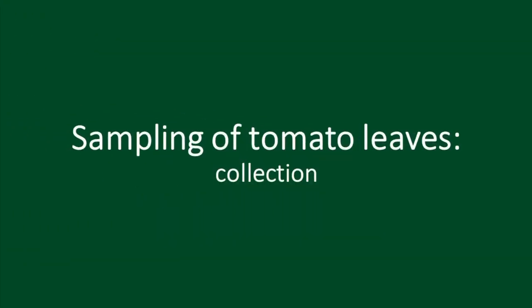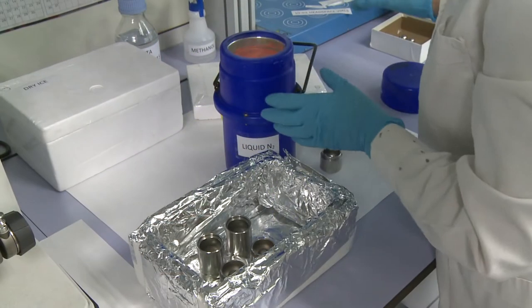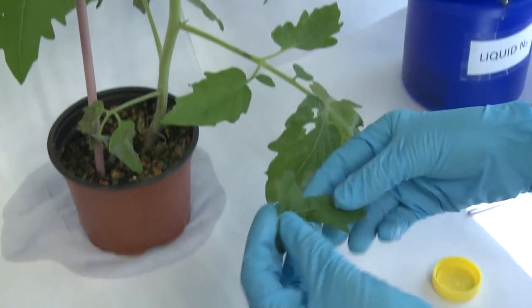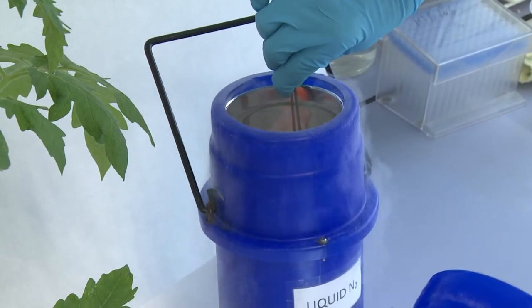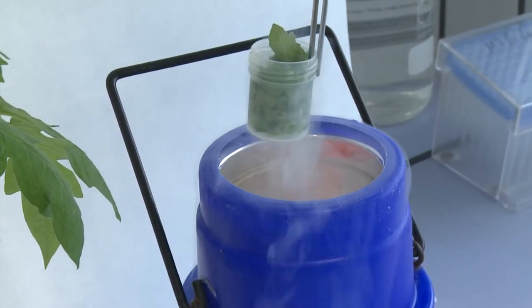Once the tomato fruit processing has been carried out, a protocol for tomato leaves manipulation will be described. Provided you have liquid nitrogen in the container, carefully remove the tomato leaves, the third or fourth from the apex, in this case, from the plant. Be careful not to pick up stems, and transfer to an appropriate cryo-resistant container. Place in liquid nitrogen.